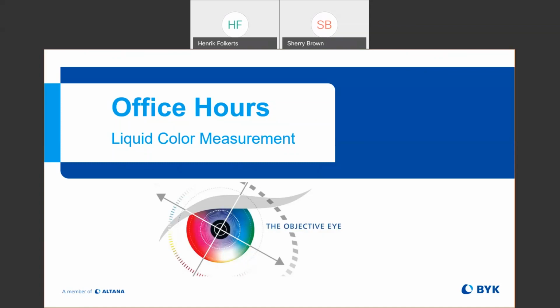So today's topic is liquid color measurement. When measuring liquids, it can be a bit trickier than measuring the color of solid materials. And so today we're going to discuss some of the methods we have available for evaluating the color of various types of liquids.